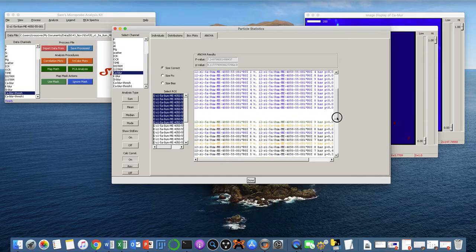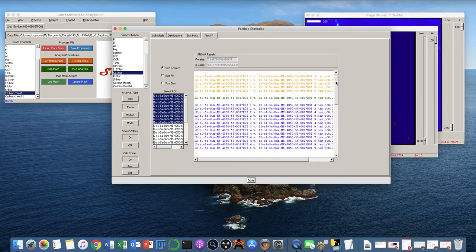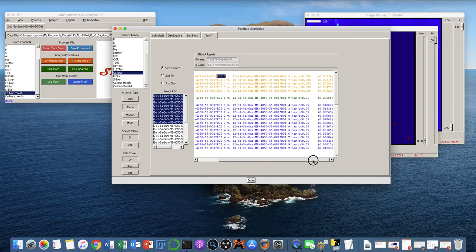So these are color coded, as you can see. And what this is telling you is that ROI 3 versus ROI 5 are significantly different at the p less than 0.005 level. In contrast, ROI 8 versus ROI 9 is significant at less than 0.01. ROI 1 is different than ROI 4 at the less than 0.05 level.